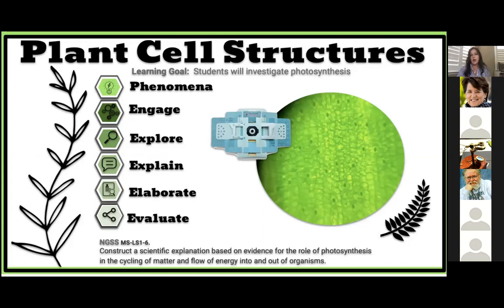And so I captured this image here of the stomata, which was new for me. I hadn't done that before, and I was looking for what I should be looking for. I used the Microcosmos and searched up things on the Foldscope website. I called my science mentor here in the school district, who's our STEM director. I sent him pictures. Is this it? Is this it? So I just want to encourage you, if you're looking at something and you're not sure what it is, reach out to experts, because the amount of help that I've had has just been phenomenal for when I start to look at something and I'm not sure what it is.